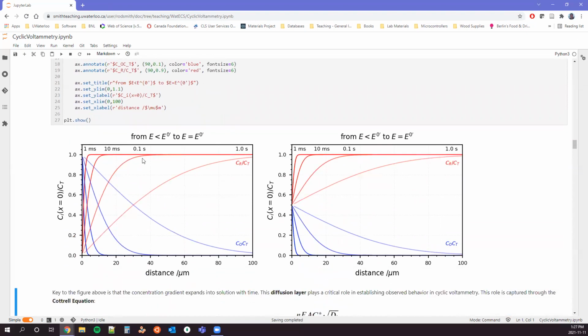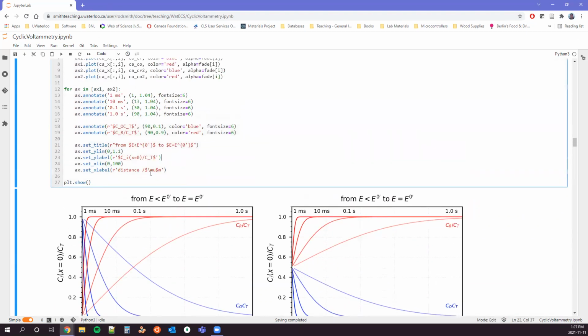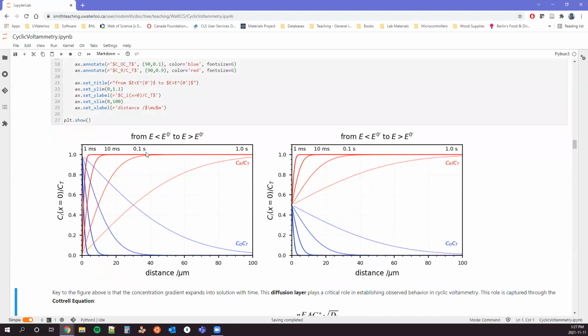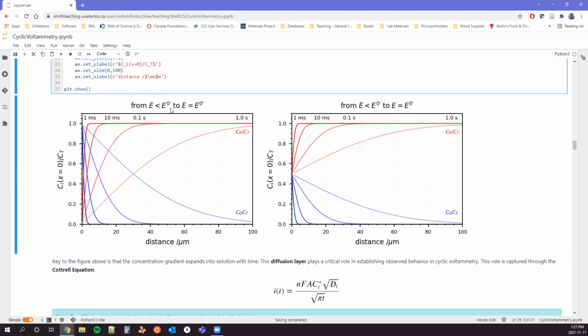And so what we're looking at is this. When we start out in bulk solution, we have 100% of this reduced species. We step to our formal potential. Sorry, these two should be different. What we're looking at here on the left is that we're stepping to a large anodic overpotential, and so we're completely oxidizing all of our reduced species to the oxidized species.